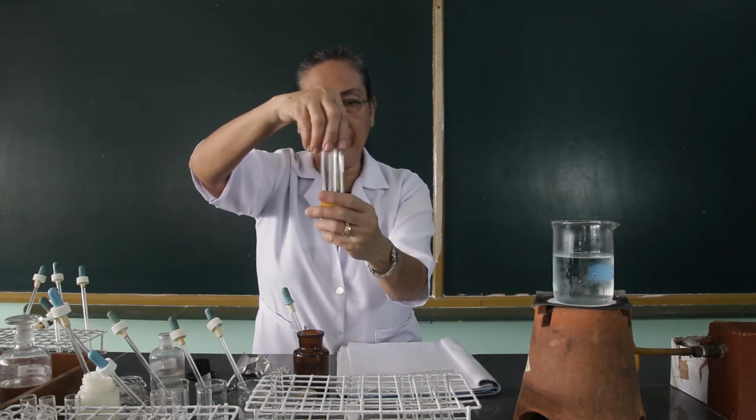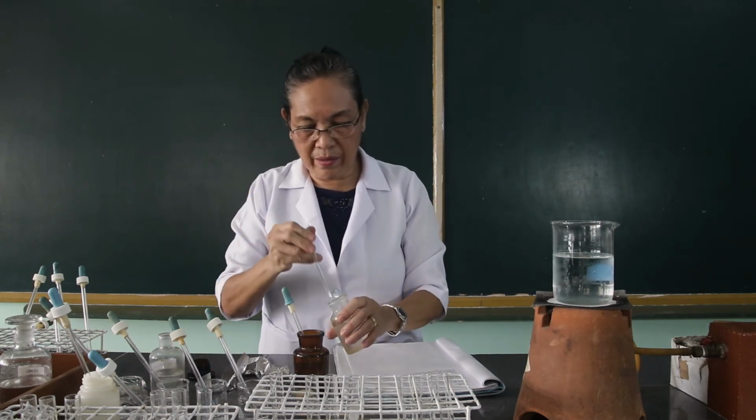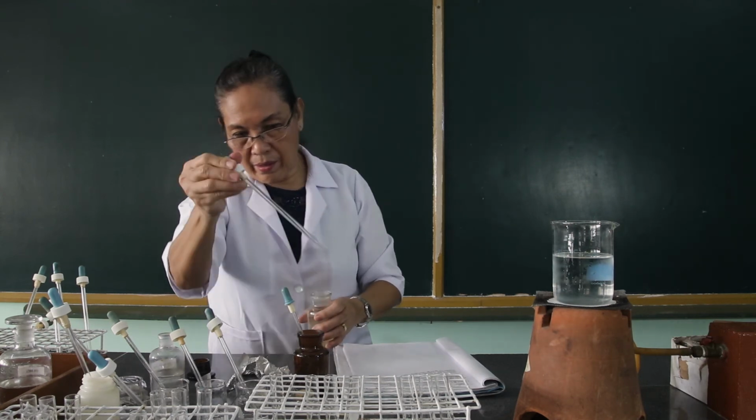Then let us add to this an equal volume of the alcohol. Double the height.